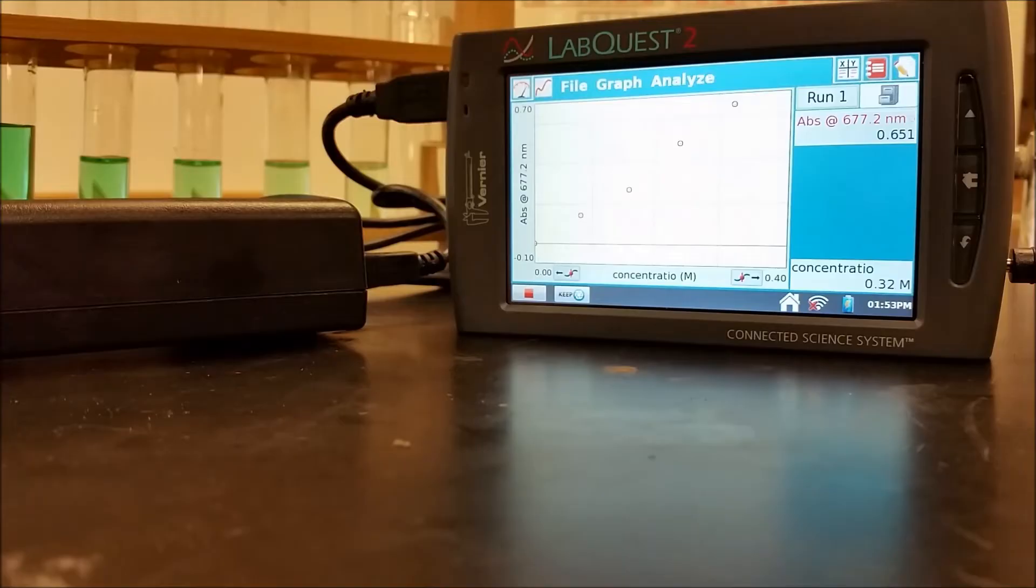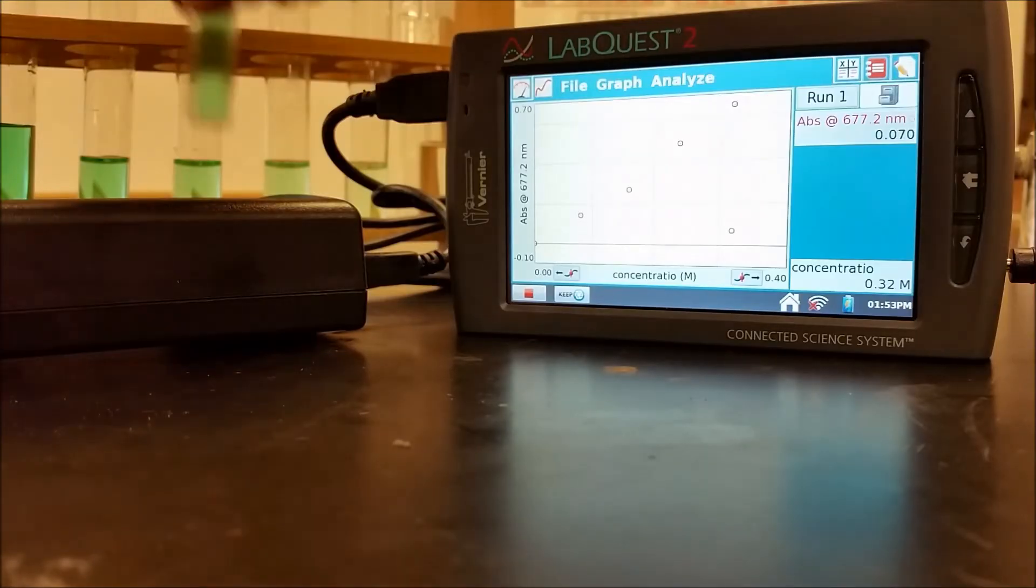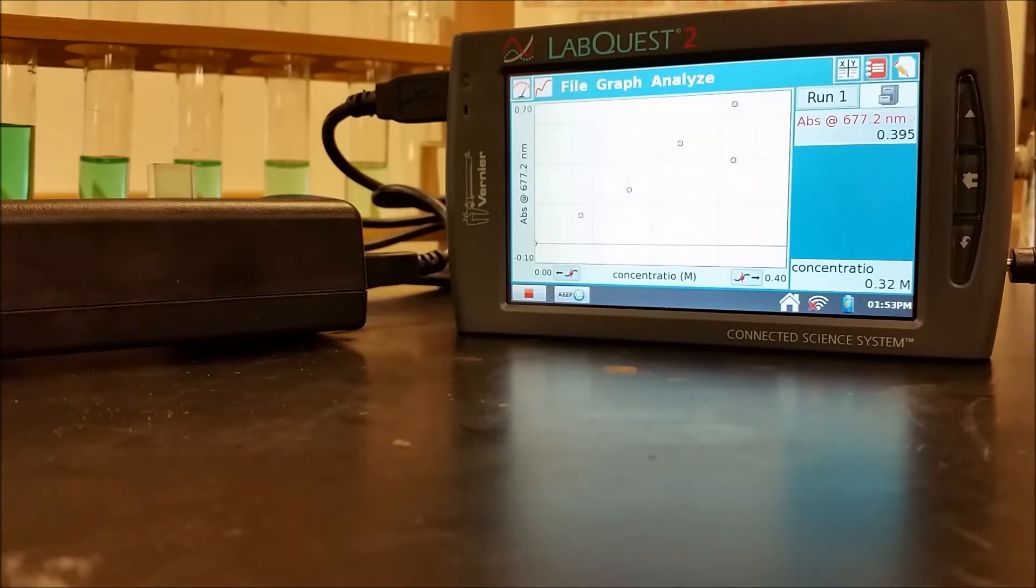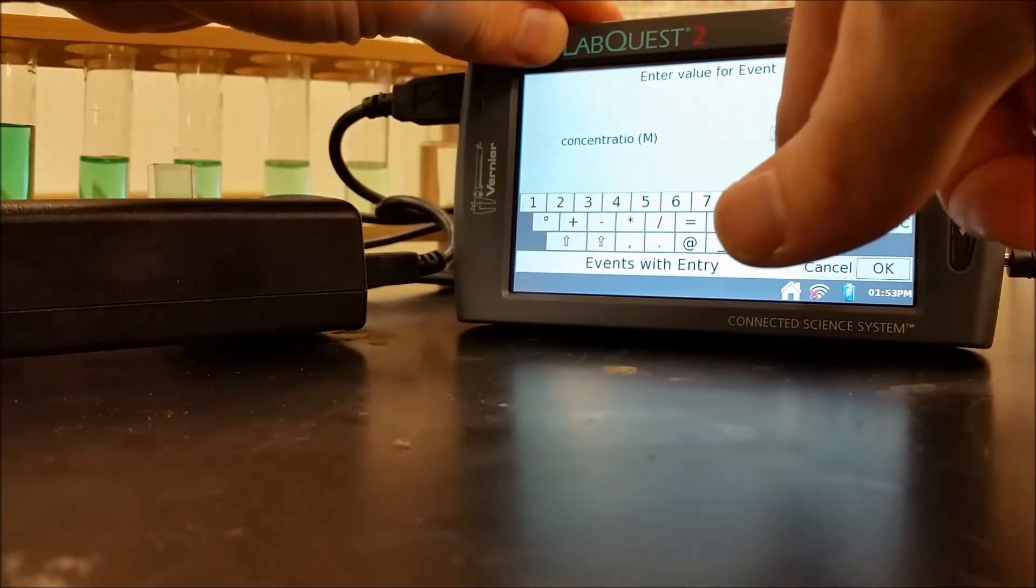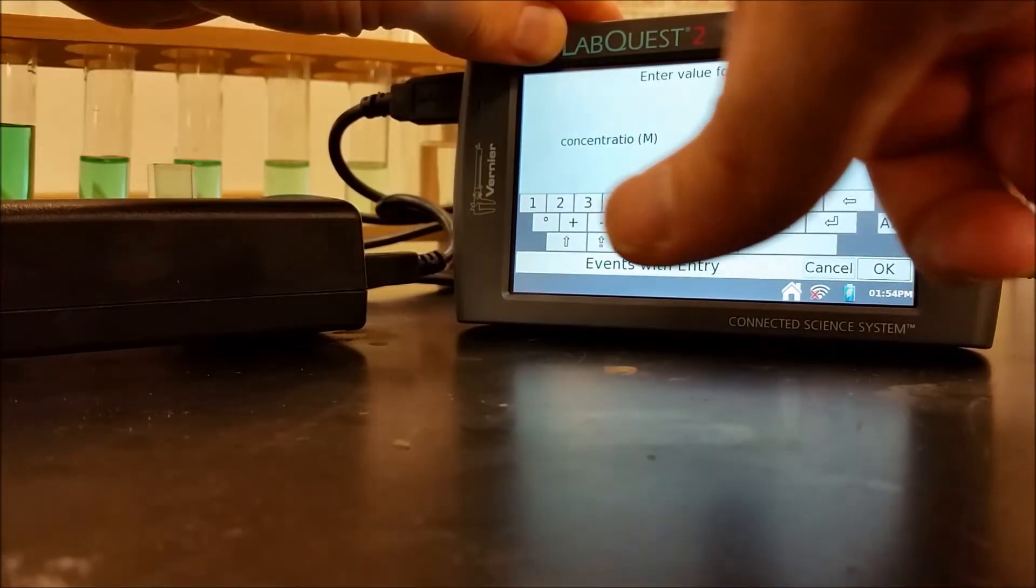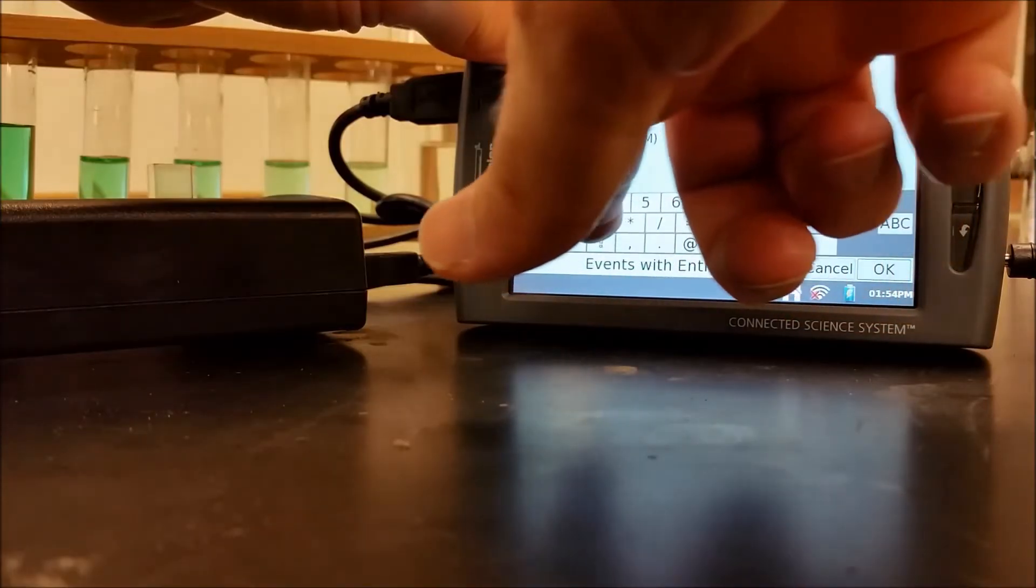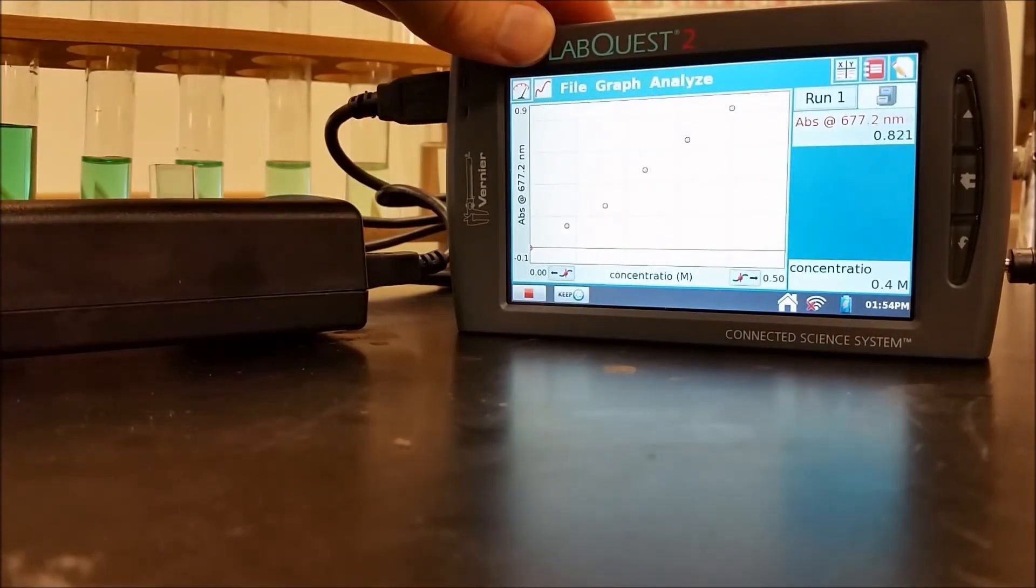And our last one, the 0.4. This one should be the biggest absorbance of all of them. And then stabilize, we can keep that.